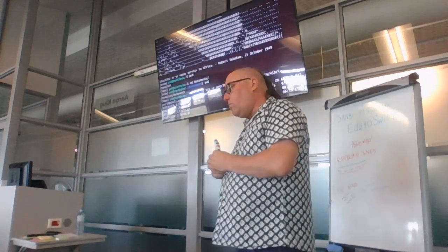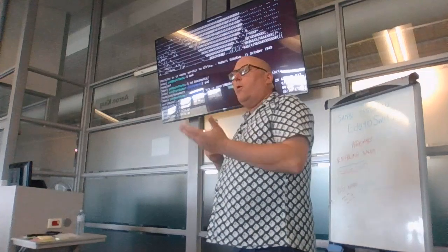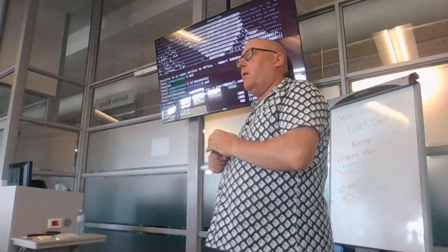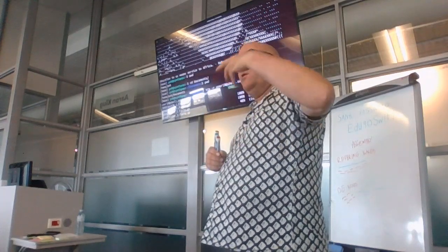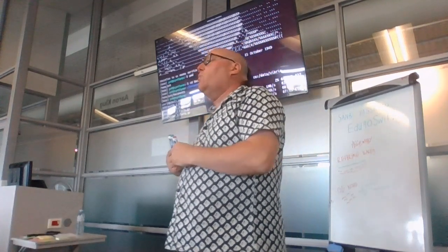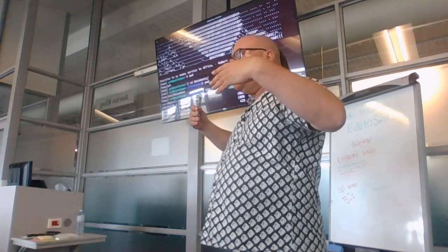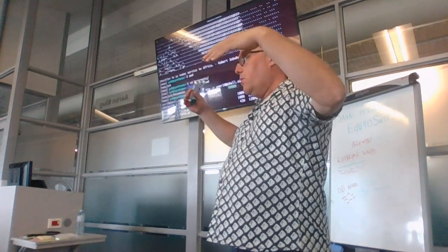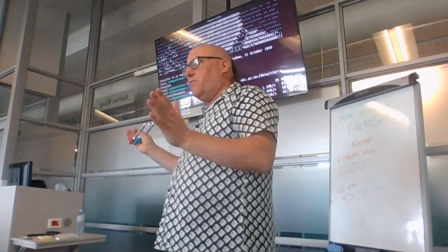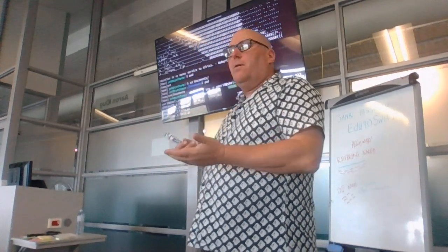Okay, the reference genome that I will be using today is one from early on in the outbreak of cholera in Haiti. Okay, so it's a sample from somewhere around 2010 was collected, was sequenced, a genome was assembled, a finished genome. Okay, so in other words, a single contig per chromosome. So a contig is one contiguous piece of DNA, and then that is used for analyzing like Haitian cholera strains.